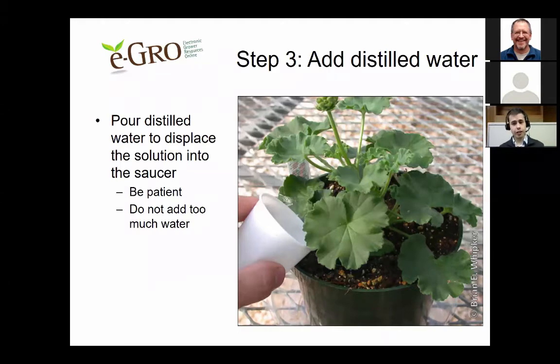In step three, after placing your pot in the saucer and letting it drain for 30 to 60 minutes, add some distilled water to the surface of the substrate. The distilled water displaces the solution currently in the substrate, pushing it out into the saucer. It's very important to be patient and not add too much water — sometimes it just takes a while for the leachate to come out. Adding too much may result in incorrect EC values.